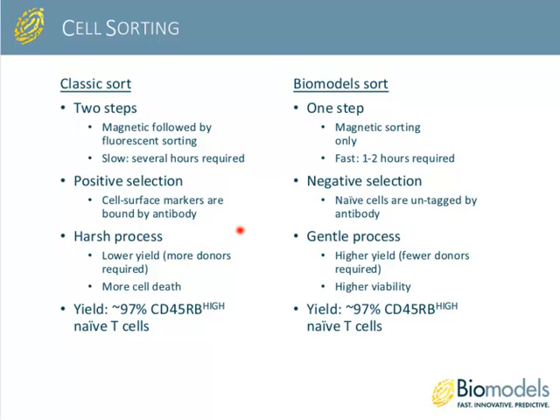And another thing that I didn't mention here is that because this step just uses a magnet and it's very small and compact, you can do the whole thing in a biosafety hood, so it can be sterile. That's not super important for the way we run the model normally, but it could be important for studies with gnotobiotic mice, and that's something that we are doing more and more of now.